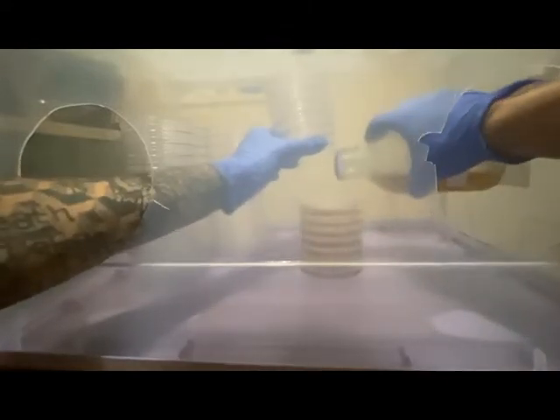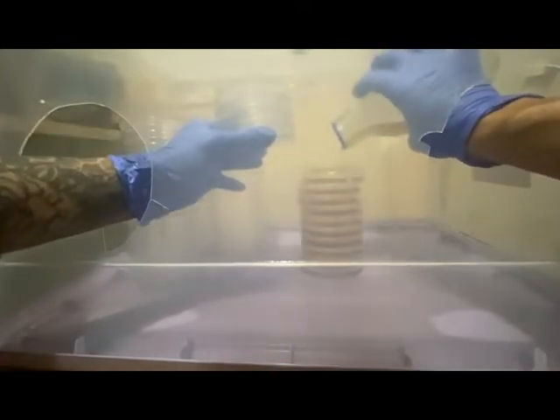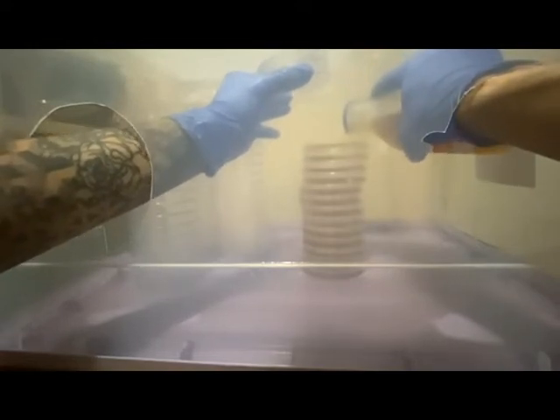I would normally pour like 200 plates in one sitting, and I'd pour like every other day. But after a couple of months of it, it got really old. Yeah, so if you pour too hot, you'll run into condensation issues. If you pour too cold, things will get chunky.